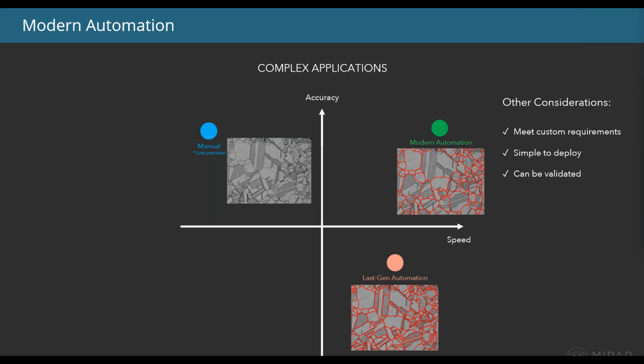Maybe there are other features in the grain microstructure, for example, that need to be ignored, or there is a non-rectangular area of interest that they need to be detected within. Maybe they want them classified into different tiers of size population. All of those details are generally, to many customers, just as important as the accurate feature detection.